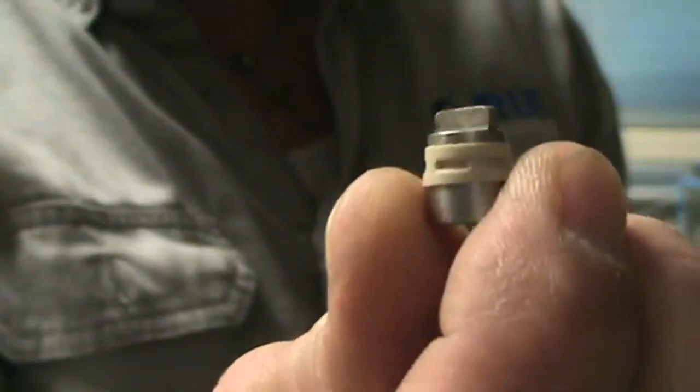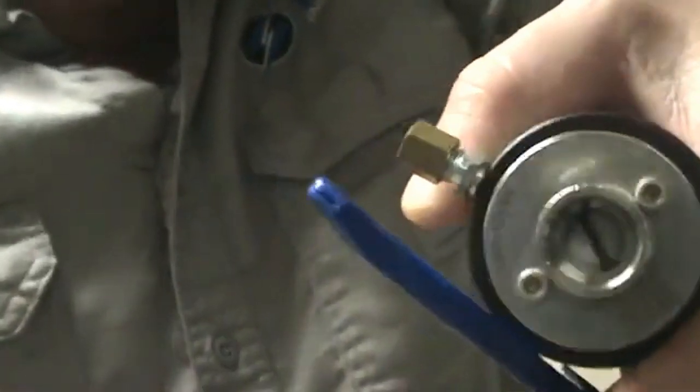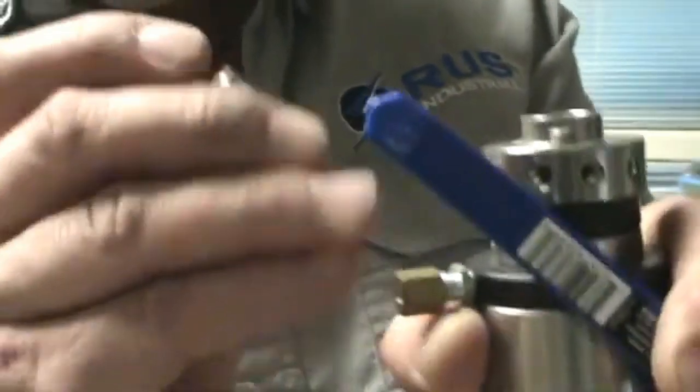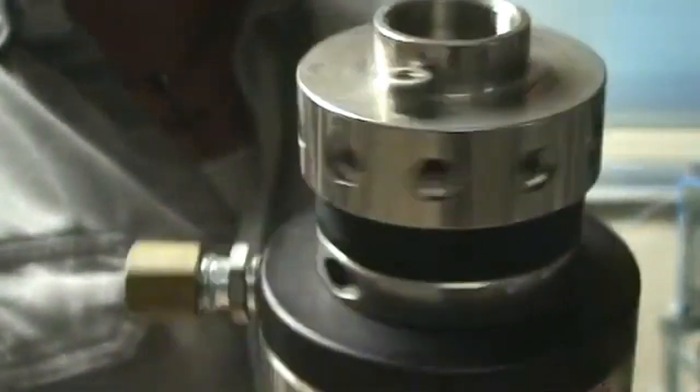See the cuts on the rotor? Those are precisely made cuts of a certain quantity in microliters. They connect up the inside of this, and those will do our flows.